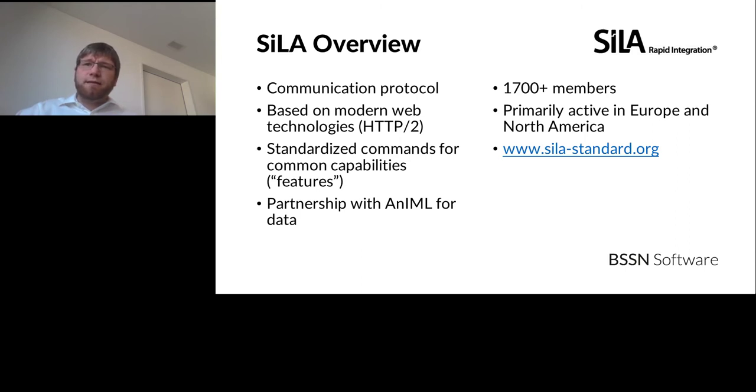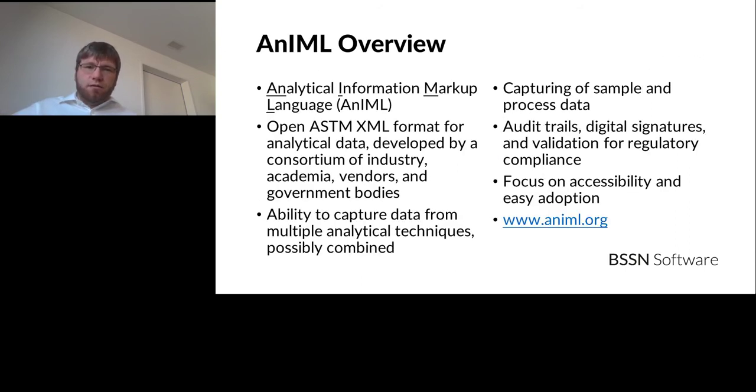And it's primarily active in Europe and North America. And there's a website if you want to learn more. It's a very active community. And that's about SiLA. So next up, we'll talk about AnIML.